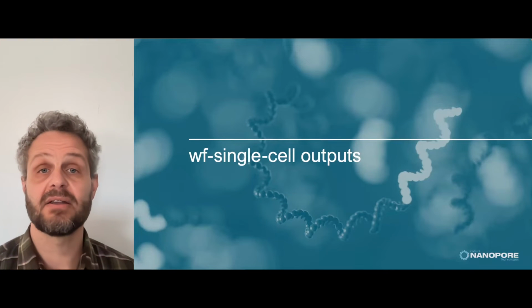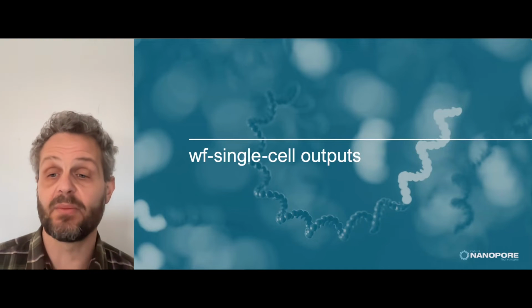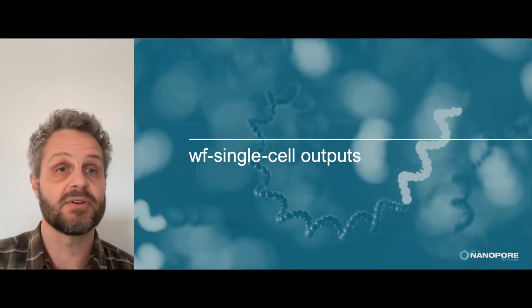Okay, so now that wf-single-cell is completed, we should have some outputs that we can look at. So we'll go over some of those now.